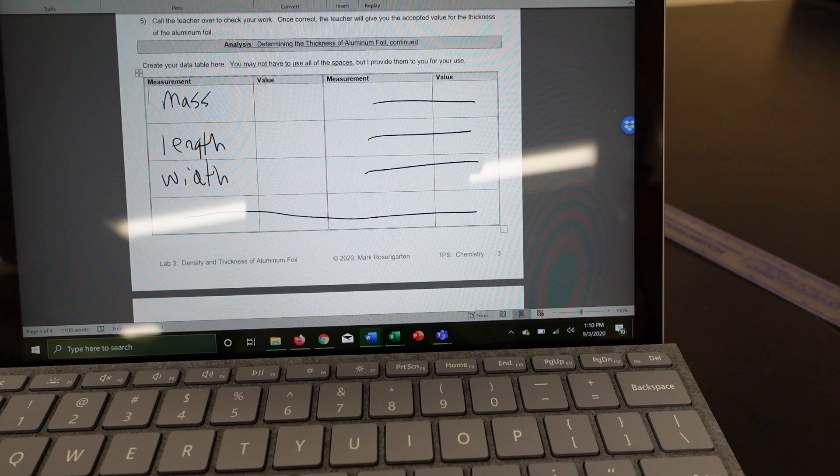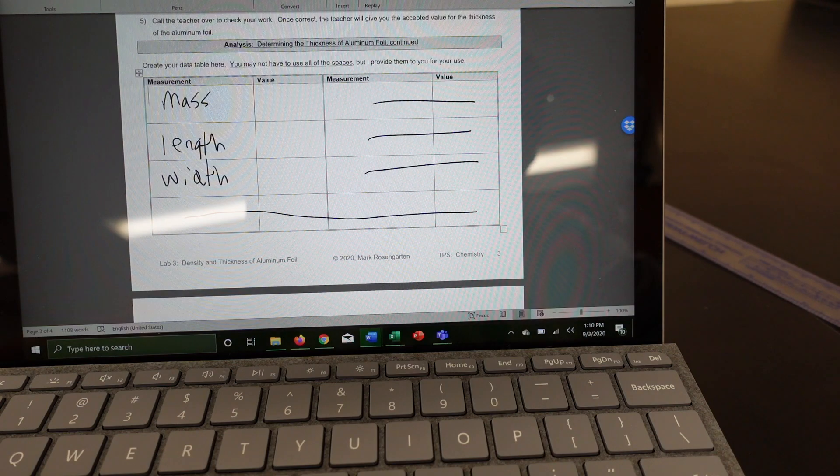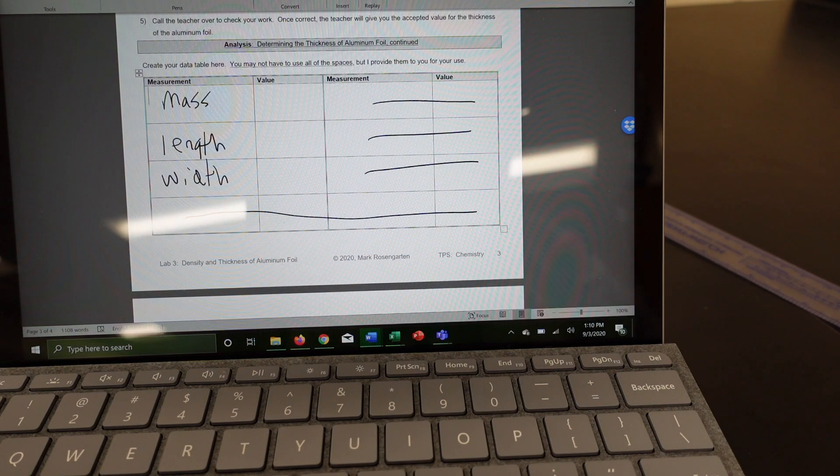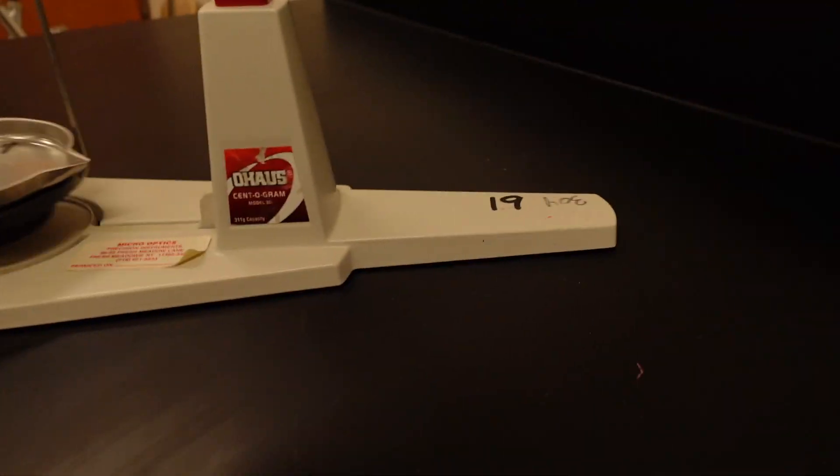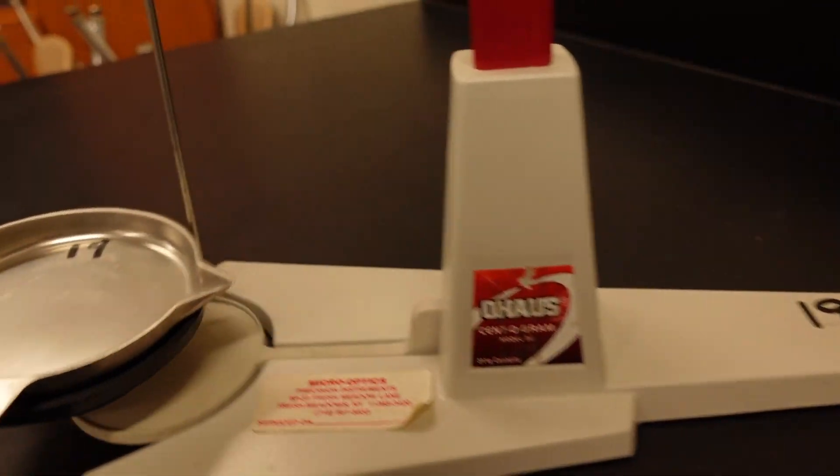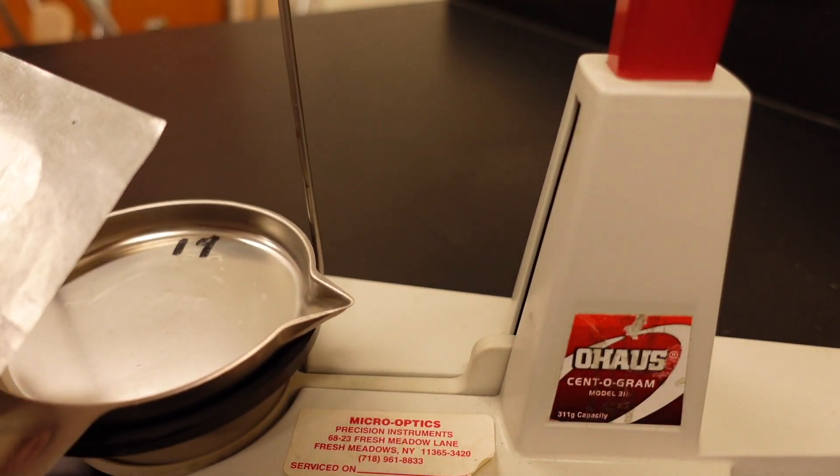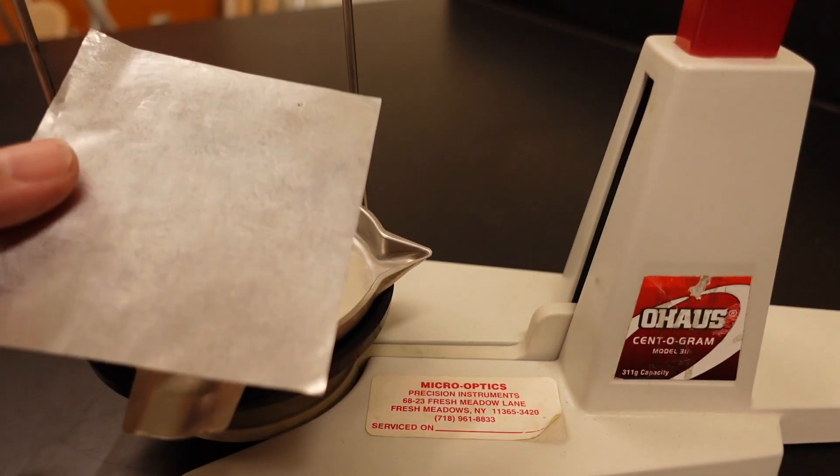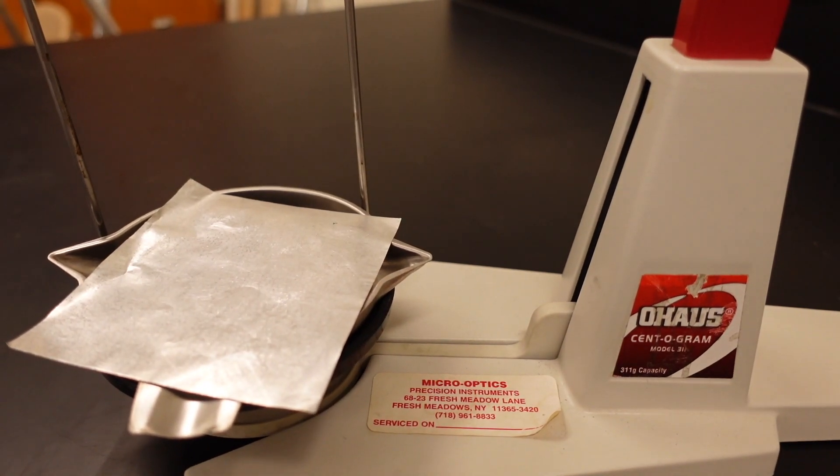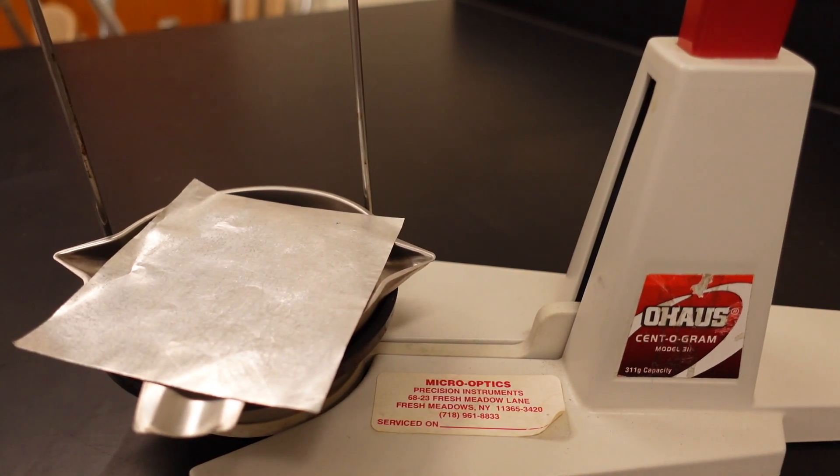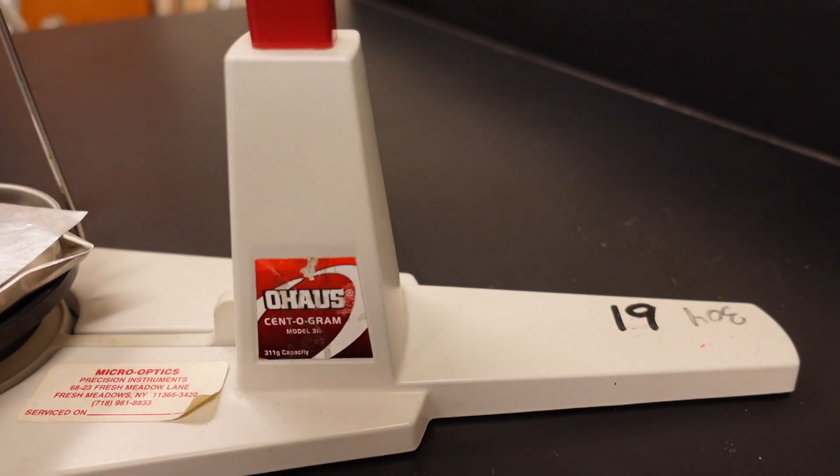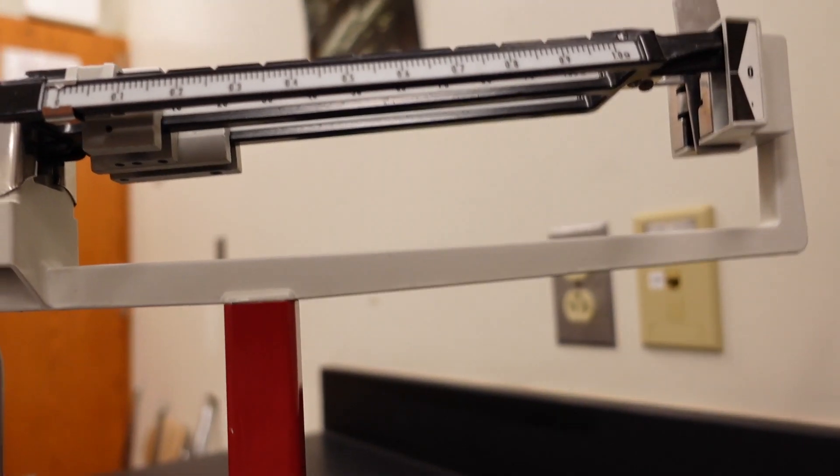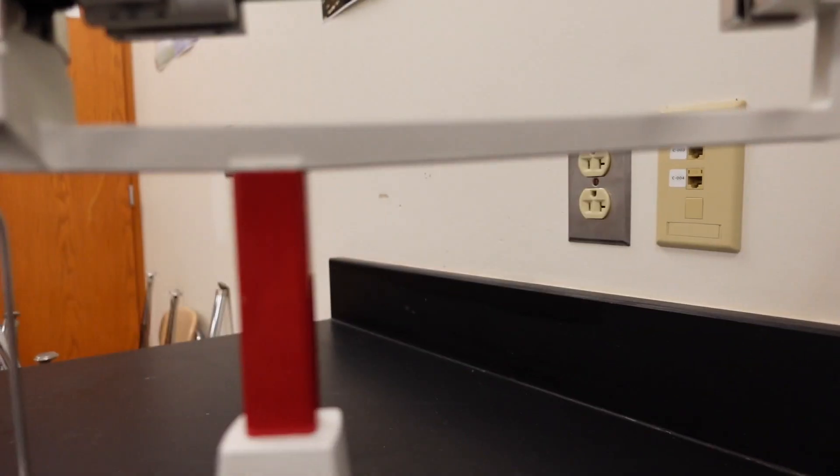First of all, the mass of the piece of aluminum foil. So let's get the balance ready. And let's put, whoo, that's one swinging balance there. We'll put that on there like so.